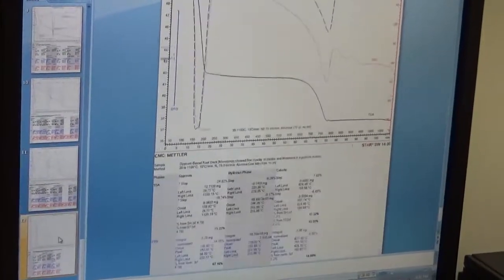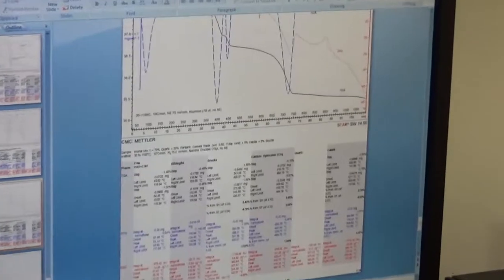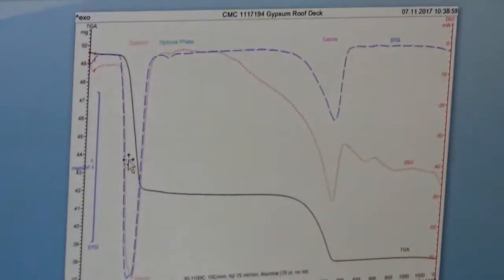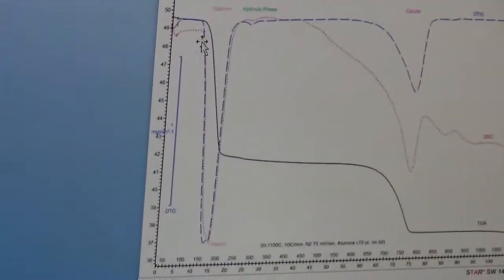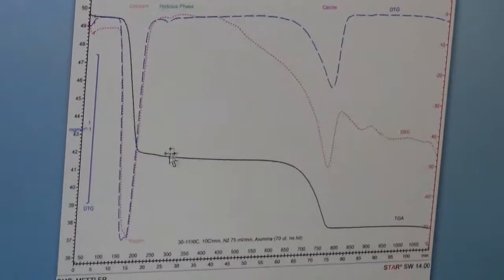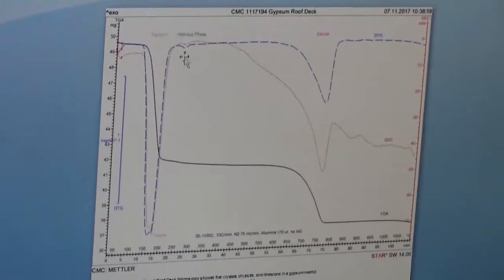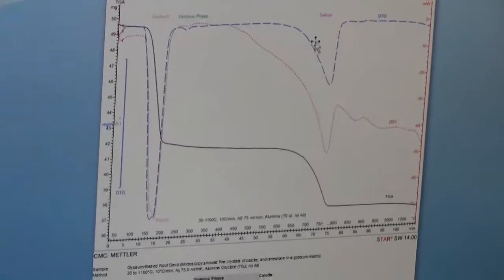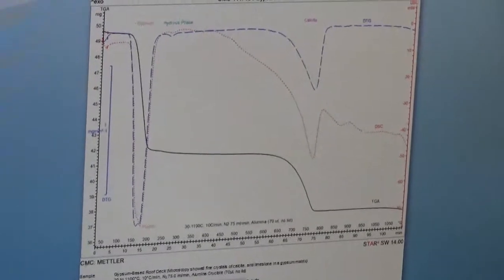Here I can show you a run we did for a gypsum sample. All it had was gypsum and calcite — it's a gypsum-based roof deck. You can see the main characteristic endotherm around 150 to 200 degrees from decomposition of gypsum, which is the main weight loss in the TGA curve. Then there is a little bump from calcium silicate hydrate phase, and then the main calcite decarbonation gives the characteristic endotherm of calcite decomposition.